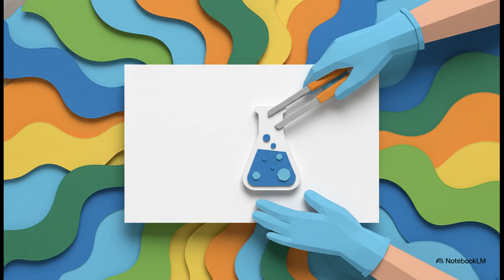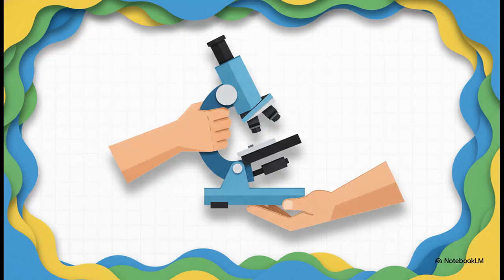If you casually grab a hot beaker with the wrong tongs, guess what? They will too. You have to actively, consciously model the stance, the grip, and the posture of a safe scientist every single time you pick up a piece of equipment. Let me give you a really concrete, foundational example of that modeling.